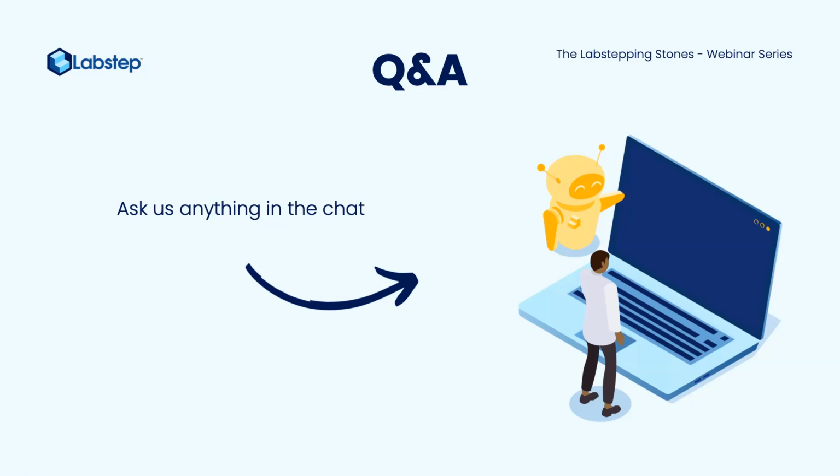Lovely. So we had a couple more questions if you're happy to stay on, Anoä. Yeah, of course. The max number of resource categories, are they the same whether you have the paid or free version? I can answer that one. Yes, they are the same. You can add as many resources as you like on the paid and free version too.